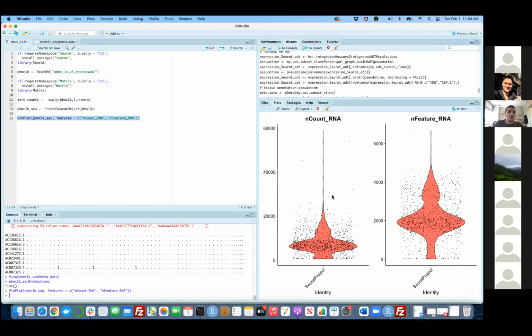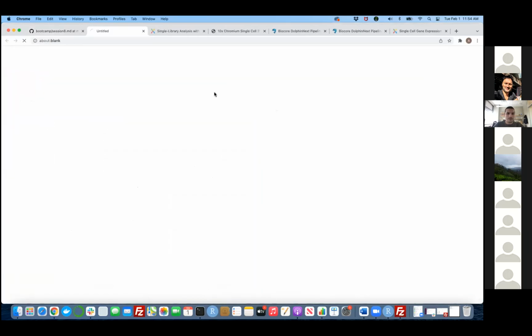That's why the UMI count is so high. This actually happens in the analysis, and what we can do with Seurat is just to assume those cells are not practical to analyze and say, okay, they have a lot of UMIs. They are not really similar to all other cells. I'm just going to remove them later, right? You can just do that too.